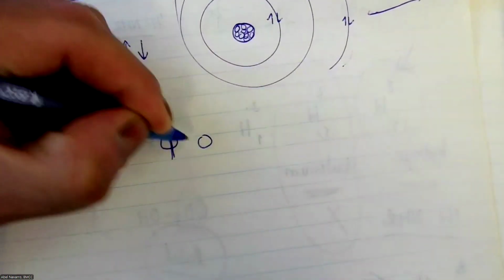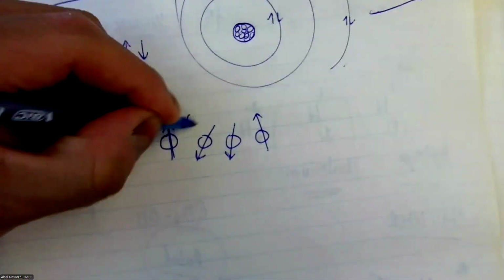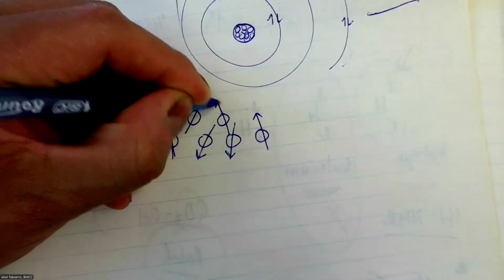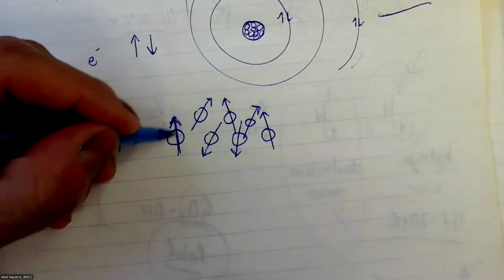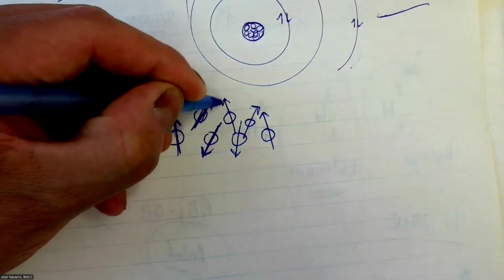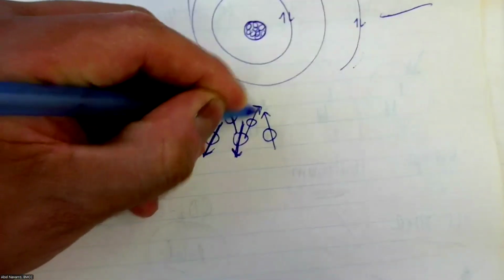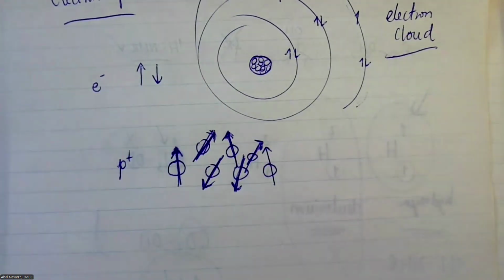Sometimes they're moving in different directions, so all your protons are moving randomly in different directions. This sphere is the proton, and the arrow that you see is the vector for the spin, in this case called nuclear spin. That happens in nature.